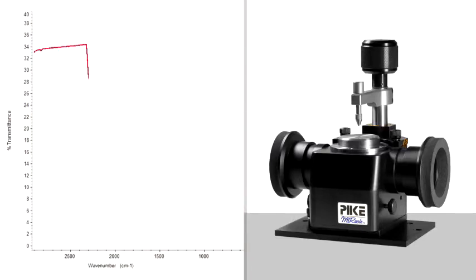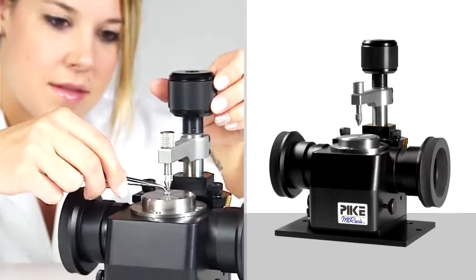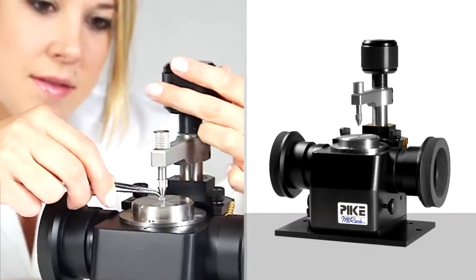Given the pliability of the samples investigated here and the high energy throughput across the spectral range, a MIRacle ATR accessory with a zinc selenide crystal was used.